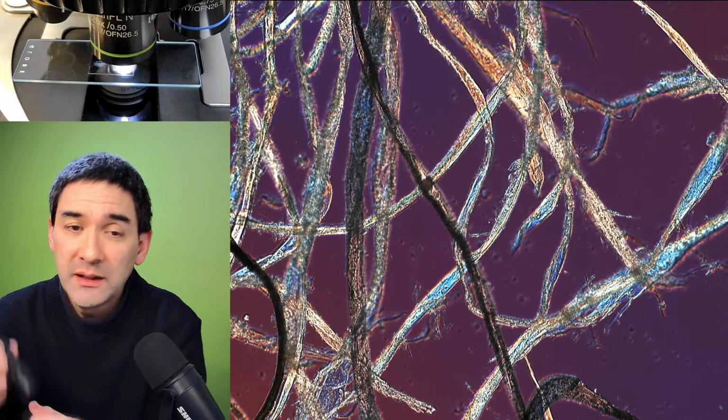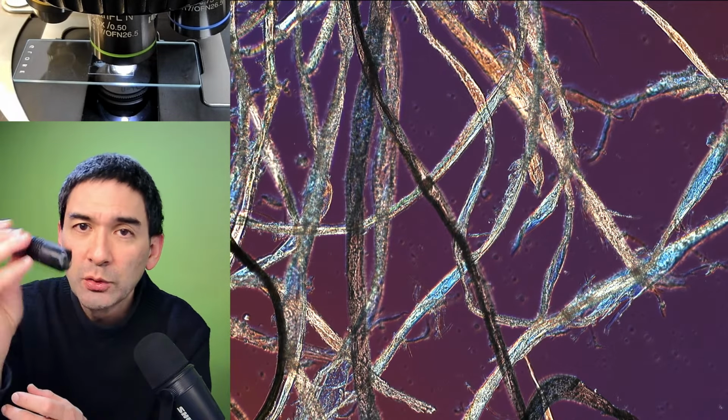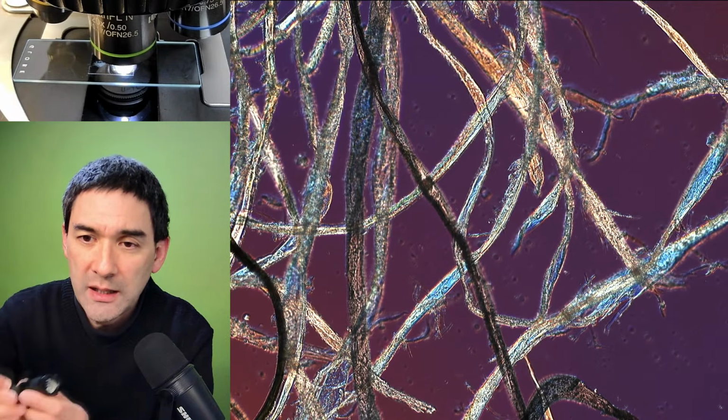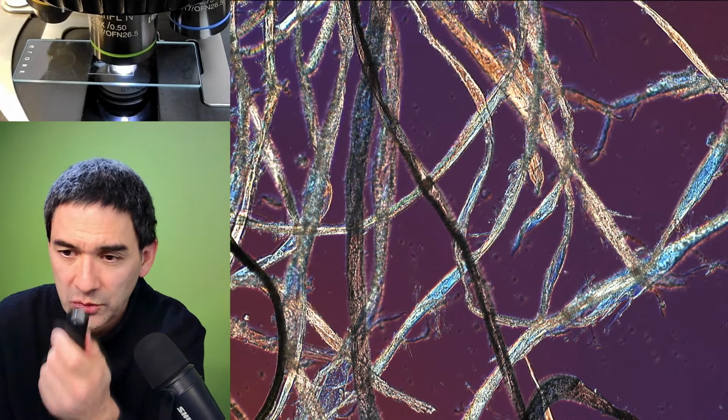And this UV light over here is actually very weak. So I don't know if this one would be enough to actually have an effect on bacteria. It might be too weak.